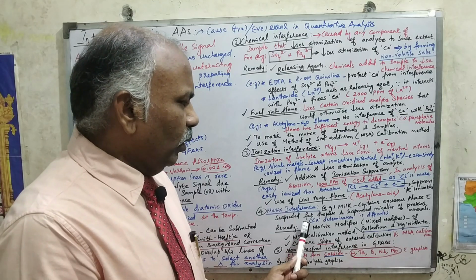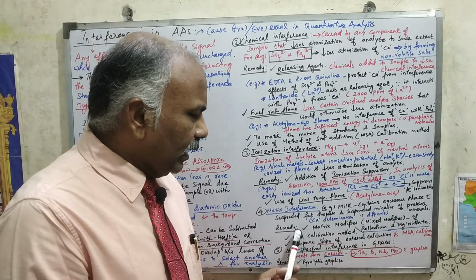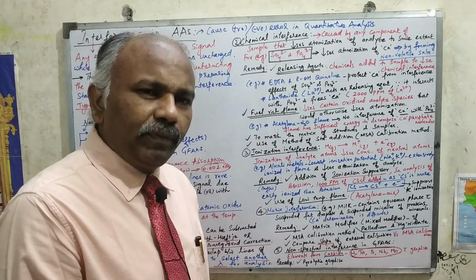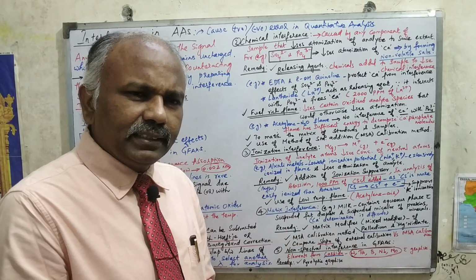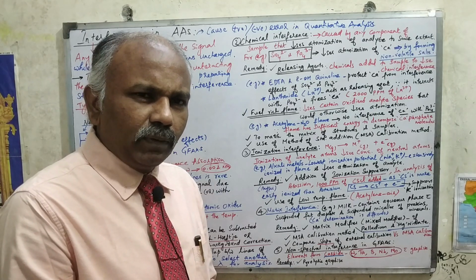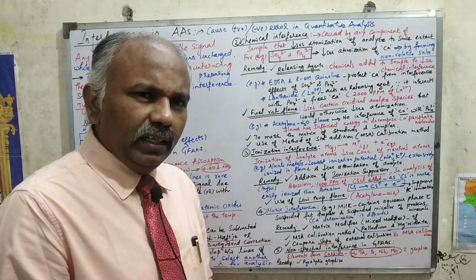Okay. So therefore calcium determination becomes very, very difficult, right? So what is the remedy for this matrix interference? We have to add the matrix modifier. I just told in the previous class also, particularly when you analyze the manganese present in the seawater, seawater contains more interference from sodium ion and chloride ion, right? Rock salt will be there. So they will interfere with the manganese ion.